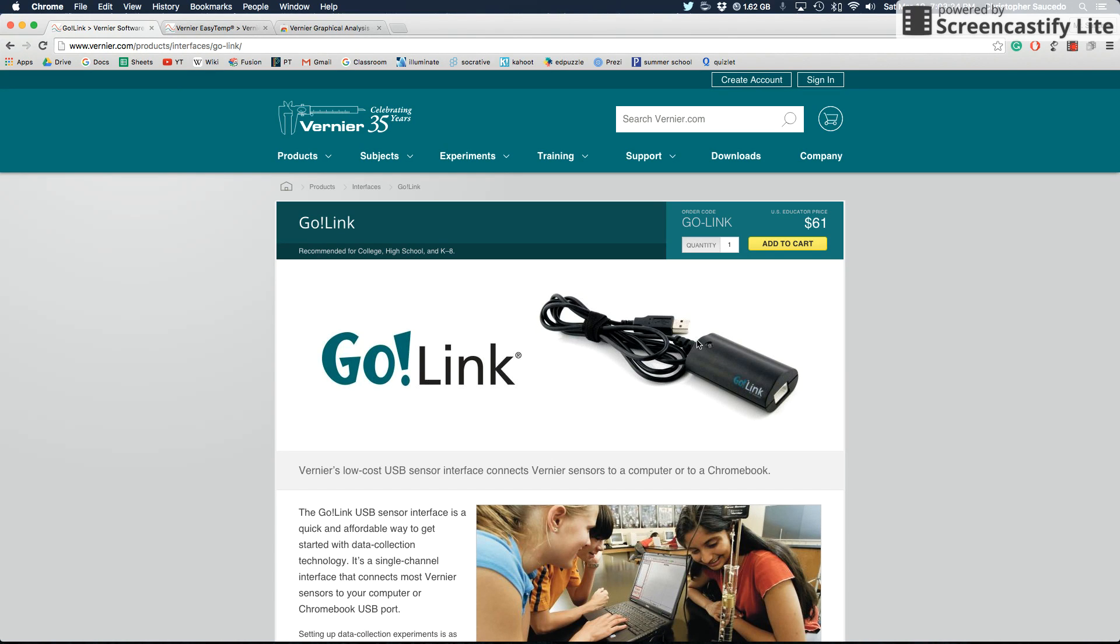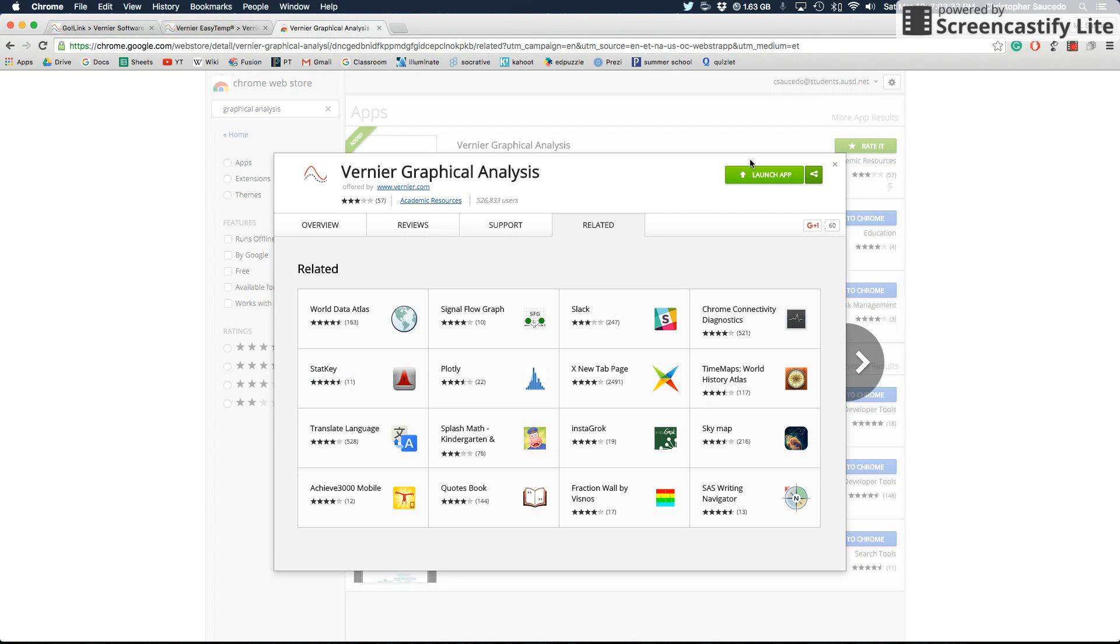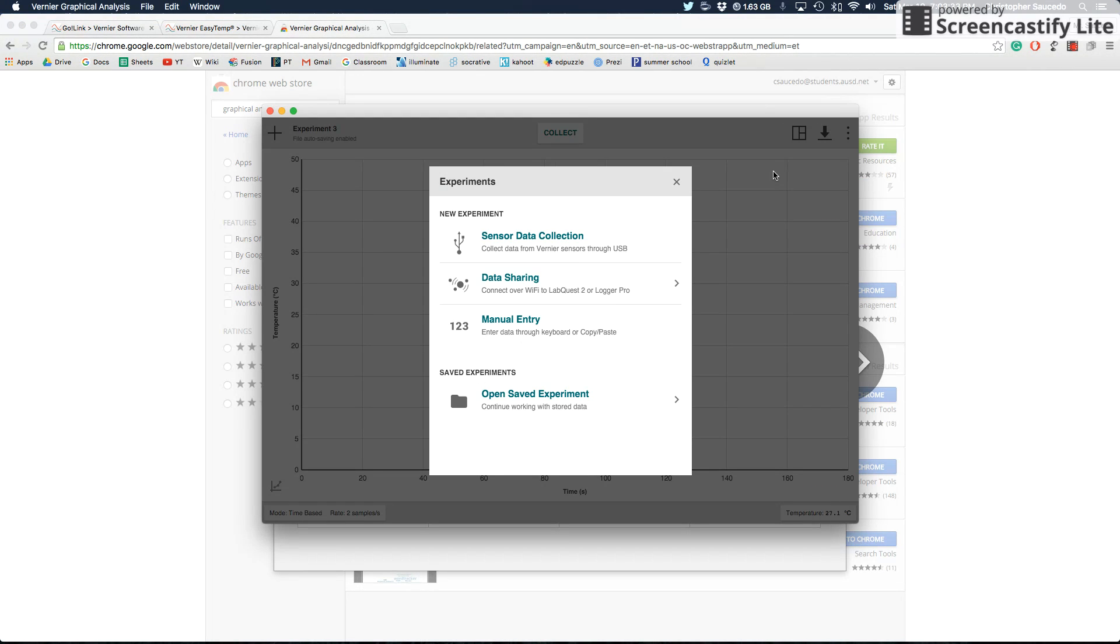When you do that, you should have a green light or something should light up on the GoLink cable to tell you that it's actually working correctly. And now that you've done that, when you click launch app, it should give you a sensor data collection, which will make sense.